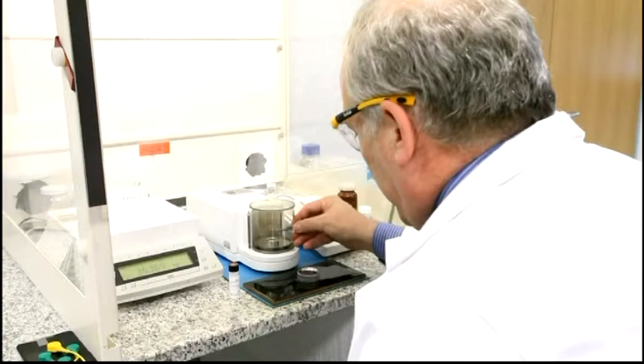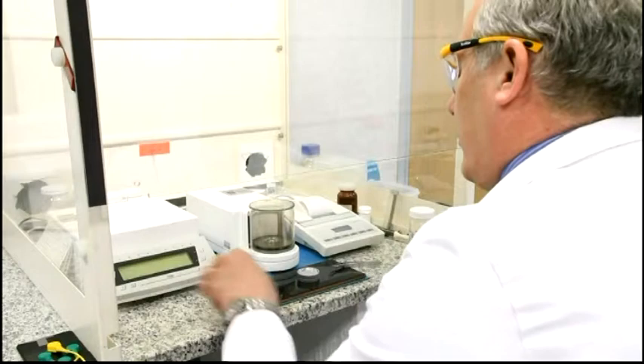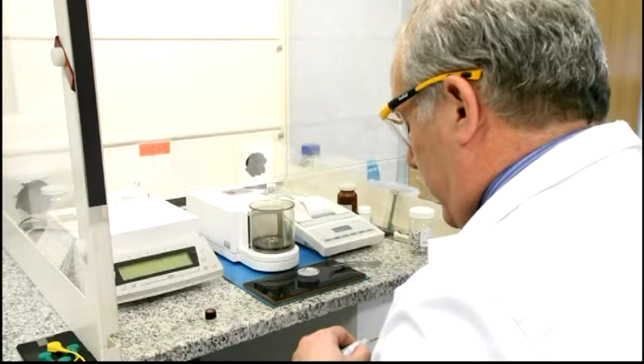A crucial part of running a CE440 Elemental Analyser is the weighing of the sample. This needs to be carried out with great care and attention. The accuracy of the weighing of the sample is critical for the accuracy of the data obtained. It has to be remembered that all data obtained is a weight percent result.